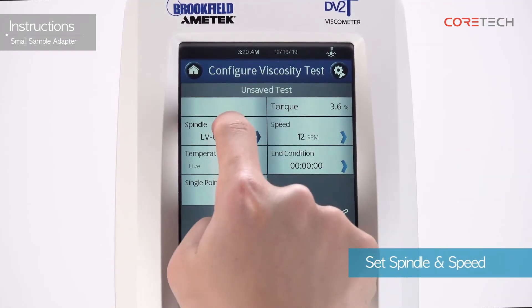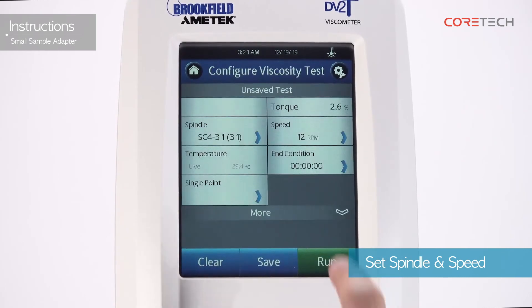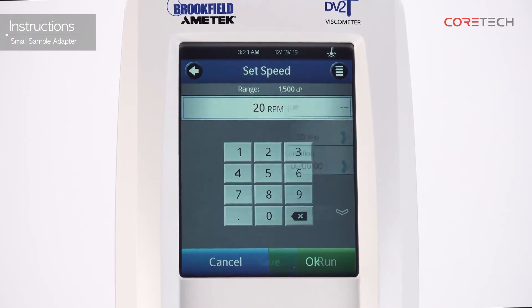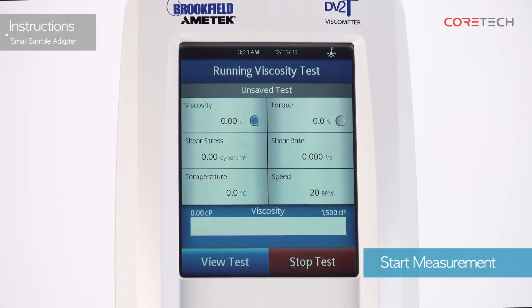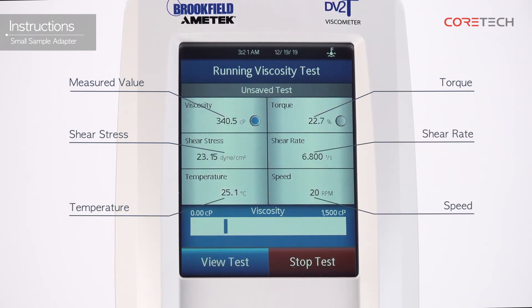Select the mounted spindle and set the rotation speed you want to measure. If necessary, you can set the measurement end condition. Press the Run button when the sample reaches the set temperature. The screen shows data from the sample currently being measured. Each displayed figure represents: measured value, torque, shear stress, shear rate, temperature, speed, and trend bar.